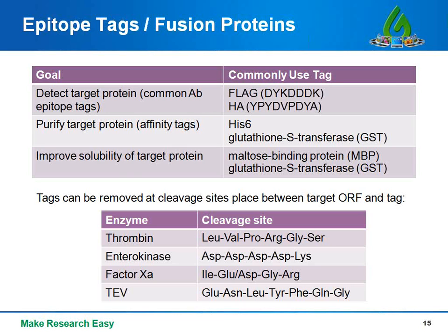Now, keep in mind that a C-terminally tagged construct will allow you to purify full-length proteins. So it might be useful if you're going to be adding a purification tag to put that on the C-terminus for that reason. Sometimes a double tagging approach could be useful. For example, you can put a solubility partner at the N-terminus and an affinity tag at the C-terminus so that you can solubilize and purify at the same time.